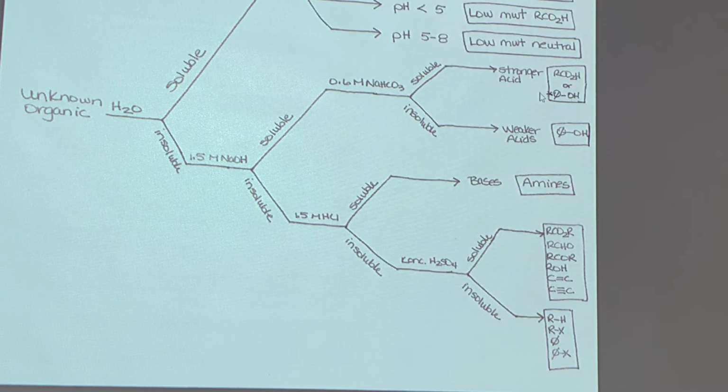Same thing here, if I know it's a carboxylic acid or phenol, I'd only focus on chemical tests that would deal with these two substances. There's no reason to worry about an aldehyde or ketone or alcohol if I think it's one of these compounds. The solubility probably takes longer to do than the chemical testing, but in the long run, it would certainly be beneficial to take the time to do that, because you can weed out what classes it could be.